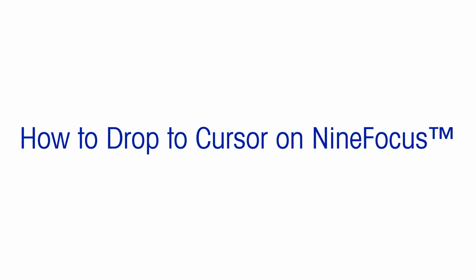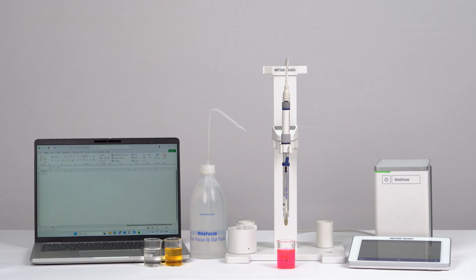How to drop to cursor on NineFocus. Data is the key output of every measurement. Let's take a look at a simple approach to get measurement data into PC applications, like Excel.